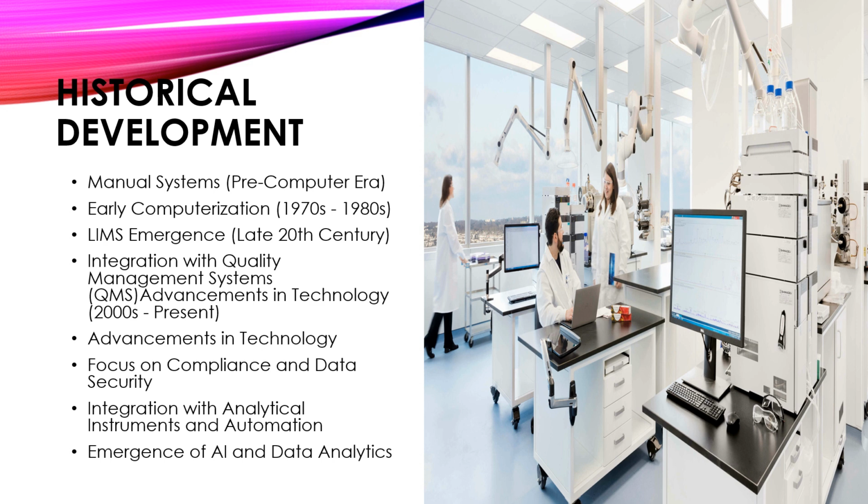Emergence of AI and data analytics. The integration of artificial intelligence, AI, and advanced data analytics capabilities into laboratory management systems is a recent trend. Now, AI-powered laboratory management systems can analyze large volumes of data, identify patterns, and provide insights that can help researchers make informed decisions more quickly.